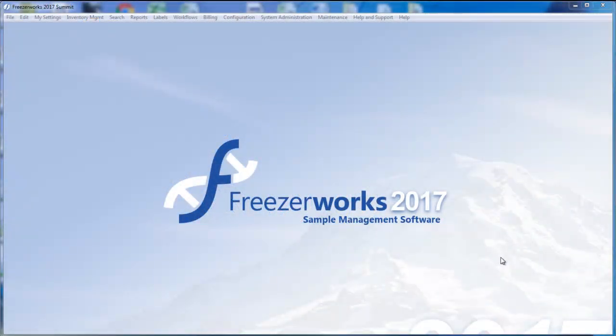Hi there, and welcome to our overview of the new flatbed scanning capabilities in FreezerWorks 2017 Desktop Client. Today we're going to quickly move through the flatbed configuration process, and then I'll show you all the tools that you can use a scanner with and demonstrate how to use our flatbed scanner overlay.